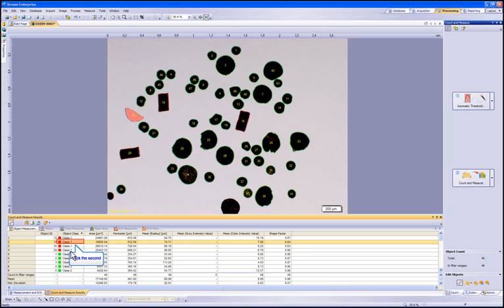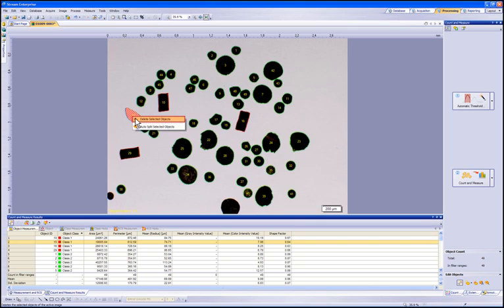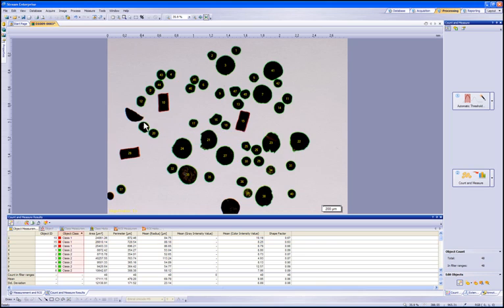To remove or delete this particle, you can simply right click on the particle to bring up the options. Select Delete Selected Objects to remove this particle from the evaluation. Once the particle has been removed, the object measurement list will be updated.